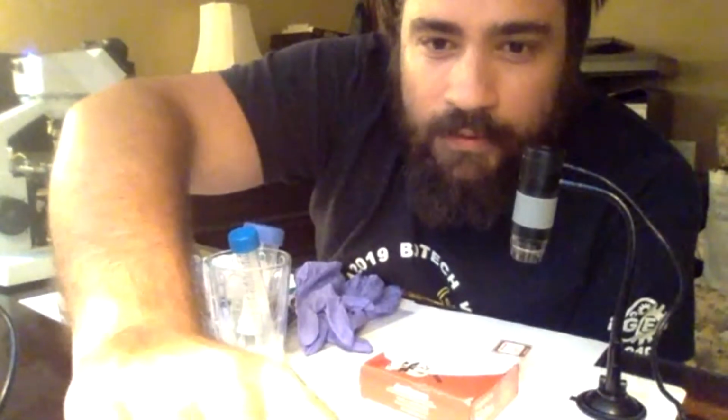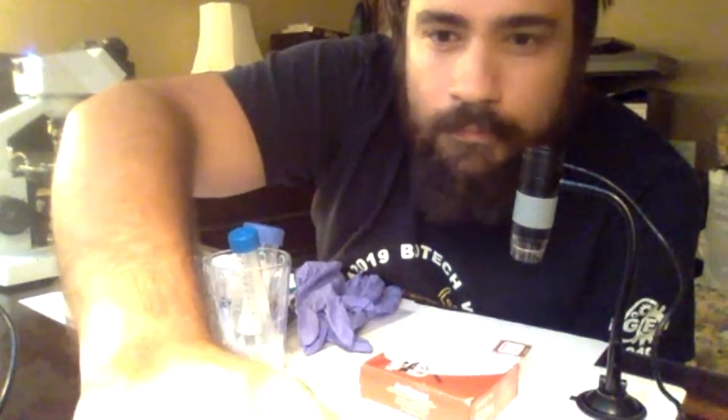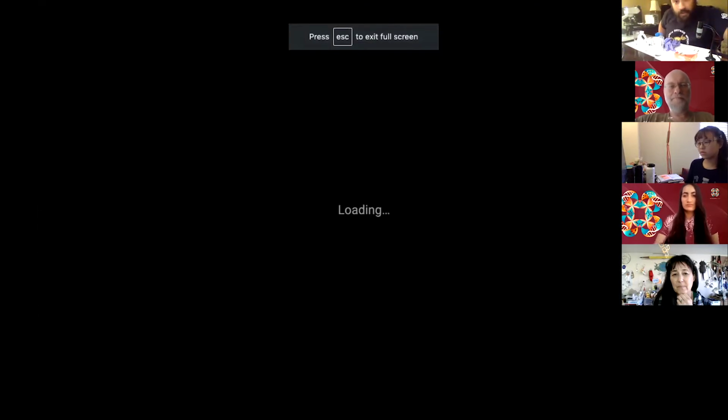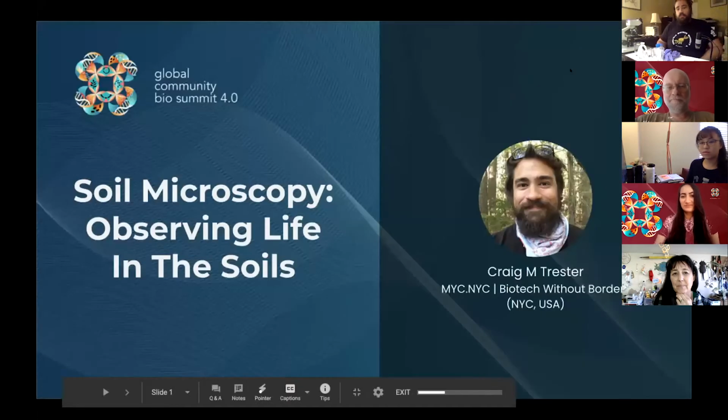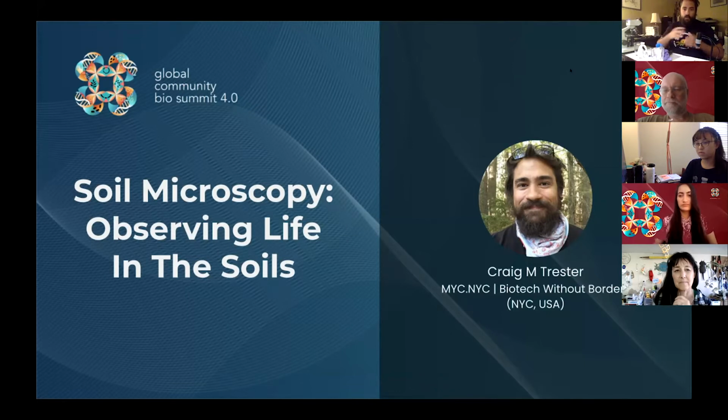All righty. So we'll go ahead and start by sharing my screen. Thank you everyone for showing up. We're going to start the session just with a bit of a presentation, going over some of the details. If anyone was at my talk yesterday, the lightning talk about soil ecology, I'm going to cover some basics, and we'll go over the cast of characters. We'll also talk about the benefits of using direct soil microscopy versus colony forming units, so plate counts.